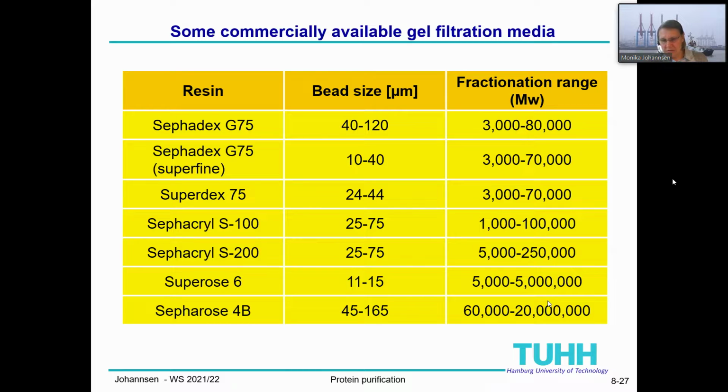You have to find a proper resin in order to separate your proteins of interest. It means you already need an idea of the molecular weight of the target protein in order to choose a proper resin here.